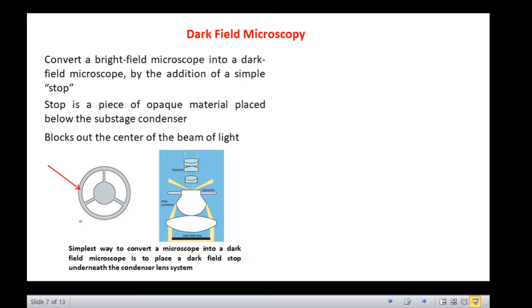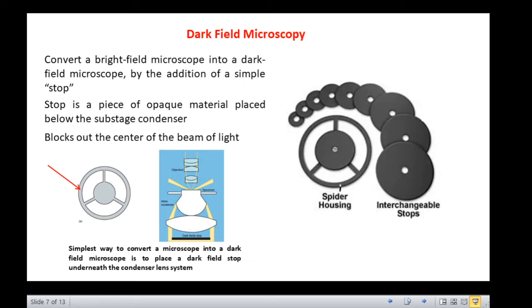This device works fairly well even with the Abbe condenser with the 10x objective up to 40x or higher objectives having a numerical aperture no higher than 0.65. The diameter of the opaque stop should be approximately 16 to 18 millimeters for a 10x objective and approximately 20 to 24 millimeters for a 40x objective.